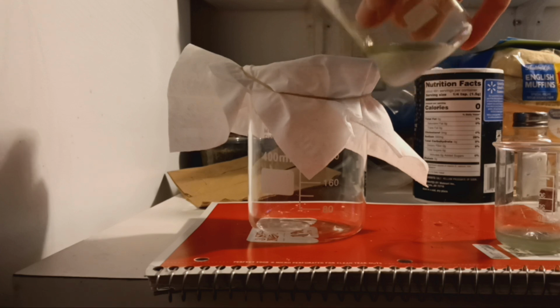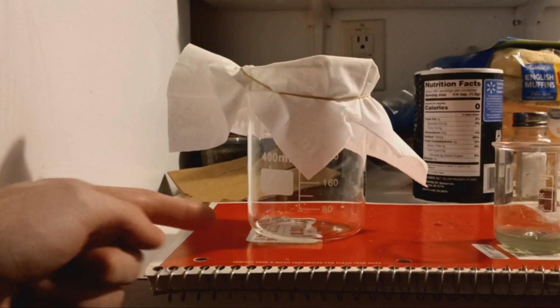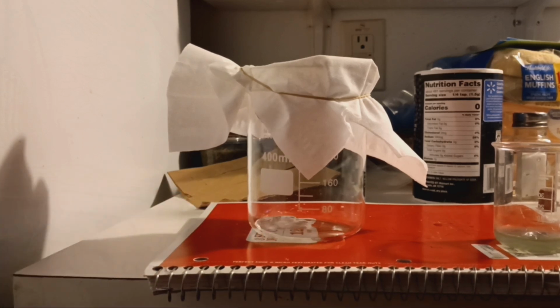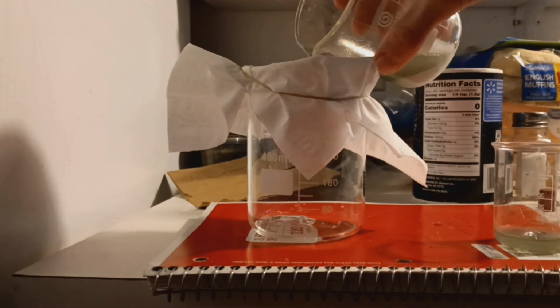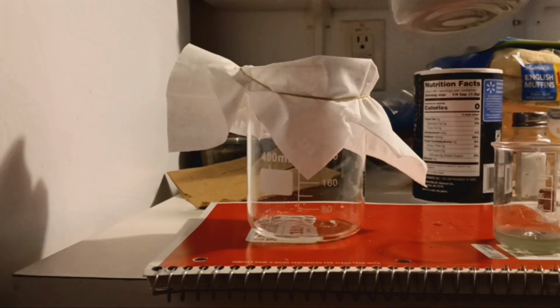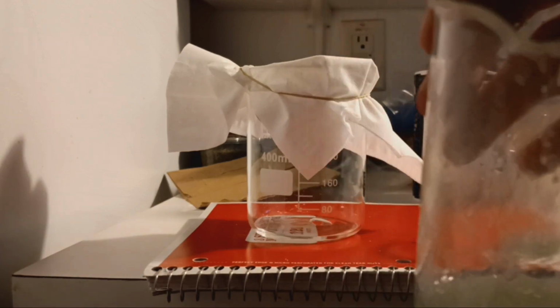However, I was ready for this and moved the iron oxides onto a piece of metal, this metal being aluminum foil. Now, you may be concerned that this could contaminate the results. Fortunately, however, it did not seem to do so. An essential part of this process was drying. This was used to a limited degree in the first experimentation.